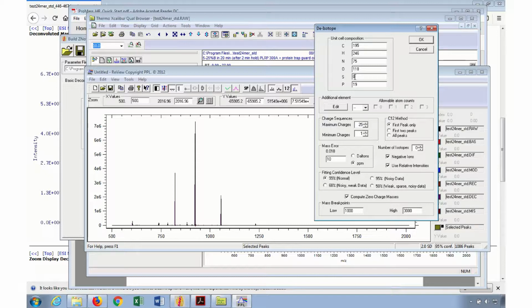So if you have phosphorothioate oligos, for example, in many cases every phosphate has a sulfur. So for example, if I have a 20 base oligo, I would also have 19 sulfurs. You would need to enter that there. In this case, the data we have is straight DNA, so I don't want to enter any sulfurs. If I'm running generic oligos, you could leave this pretty much constant, because even if the overall molecular formula is changing, the actual ratio of the elements doesn't change that much.